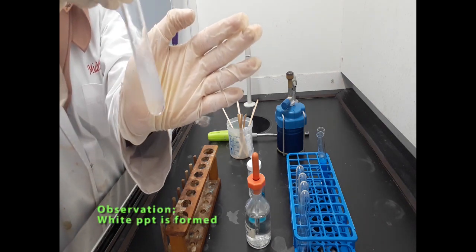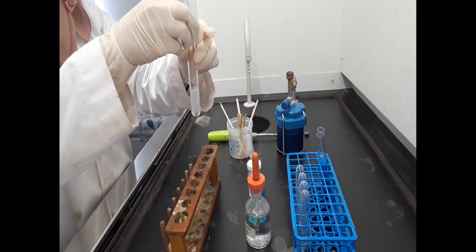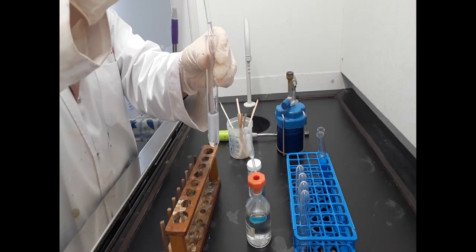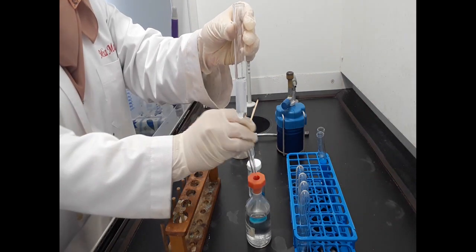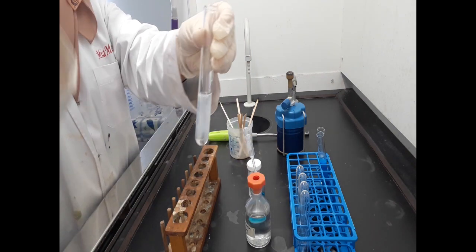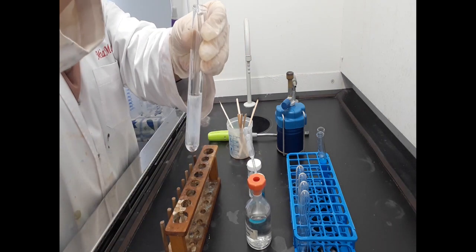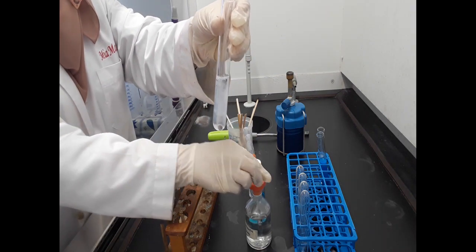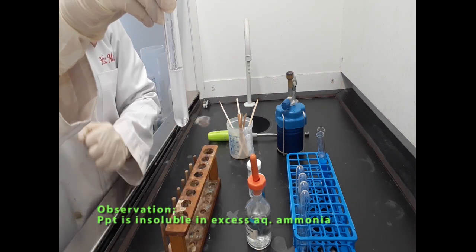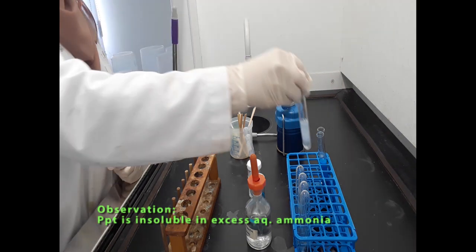White precipitate is seen. And then to the mixture from A, add excess aqueous ammonia. Keep the final mixture for use in C. White precipitate is insoluble in excess aqueous ammonia.